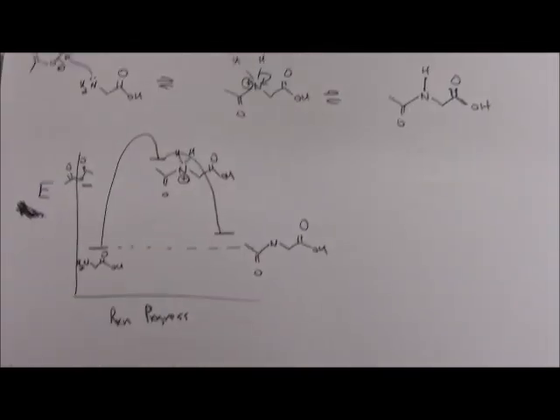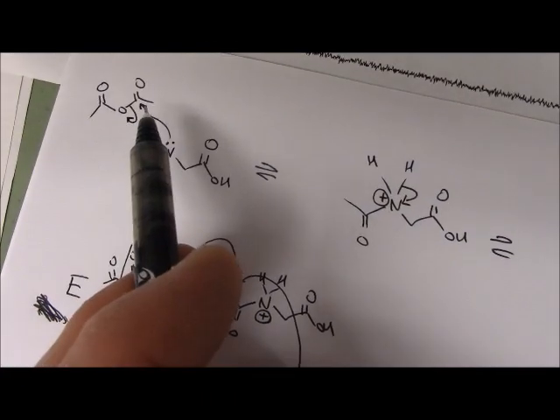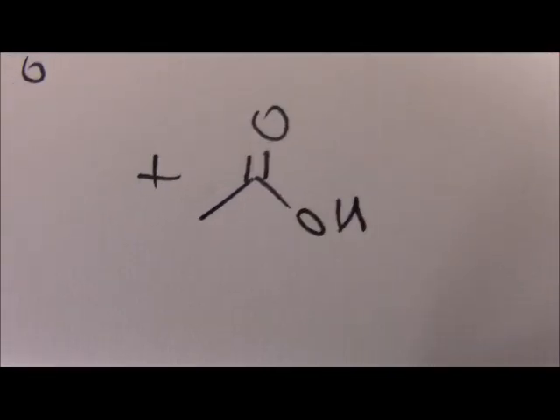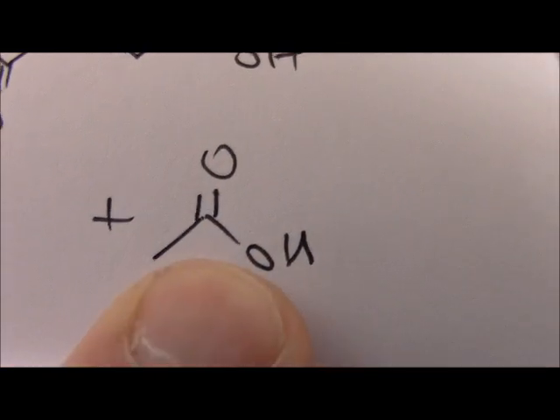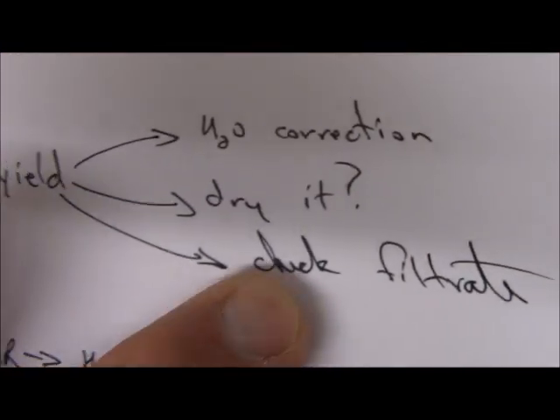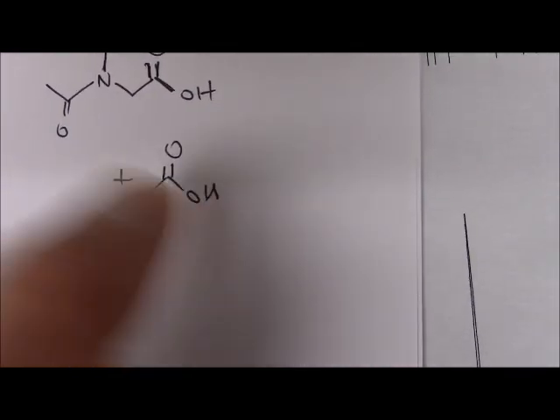So I think overall, the other observation was the smell of acetic anhydride. So one of the things in this mechanism, when that attacks here and this leaves, that piece ends up showing up at the very end as acetic acid as a byproduct. So your observation of the smell of acetic acid. So the fact is also that if you're smelling the acetic acid, the mechanism says it's there, it's crude. Part of your yield, if you ran an HPLC, maybe even your crude yield would show a little bit of leftover acetic acid on your crystals or in your filtrate. So that'll do it.